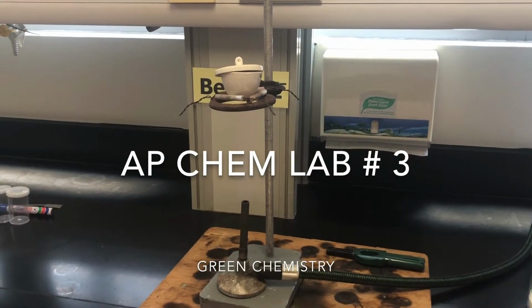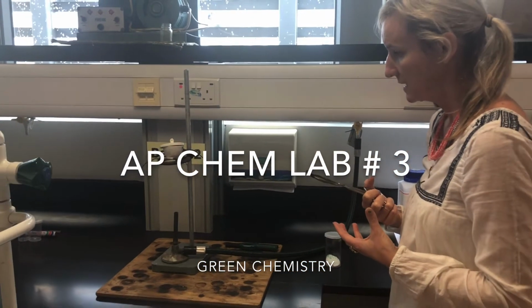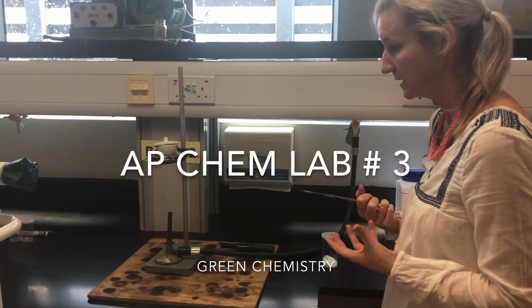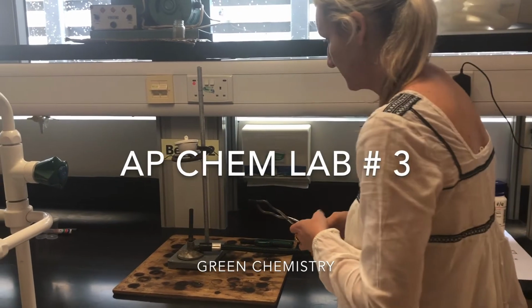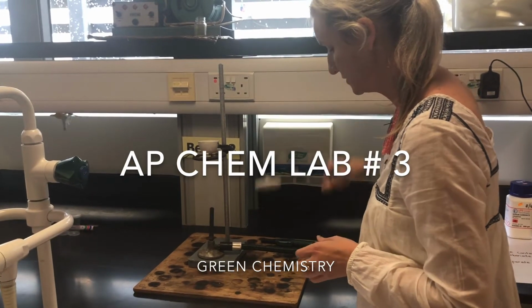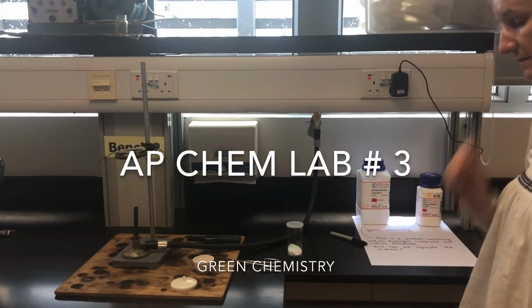What would actually happen is that some gases would be evolved from this heating. I would wait until I was sure that most of that gas had been evolved. After heating for a period of time, I would remove the crucible with tongs and place it on my heat-proof mat and wait for it to cool down.